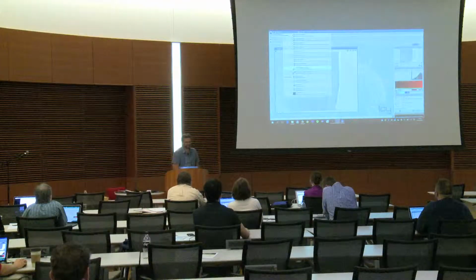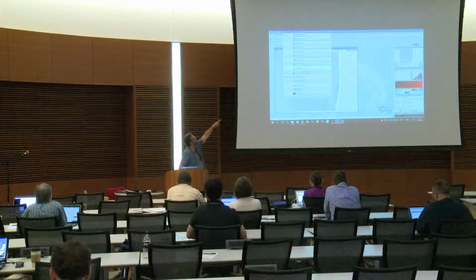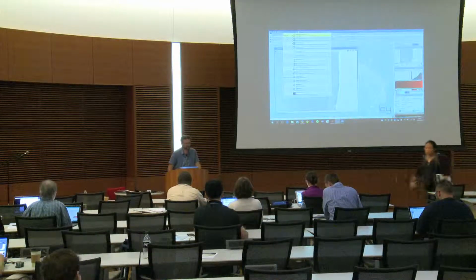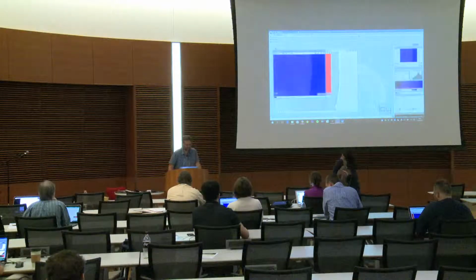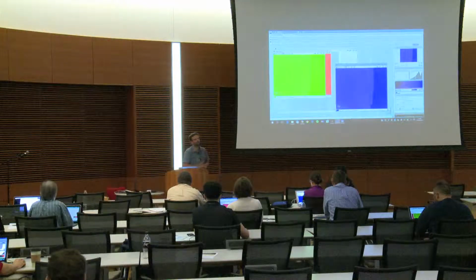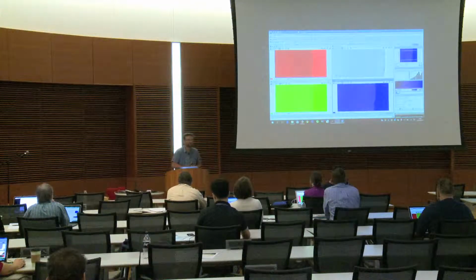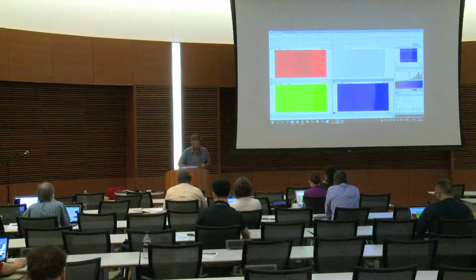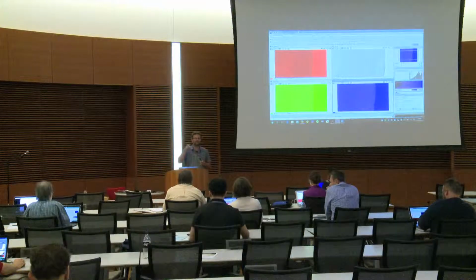So if you type EXTR in the search bar at the top, you see that the commands are following here. If you want to extract all the channels, you just type this and you click extract all channels, and it's done. Okay? And if you want to reorganize the view of the image, you just press Shift J, and this is going to put all the images in the grid like that. Shift G, sorry, like grid.